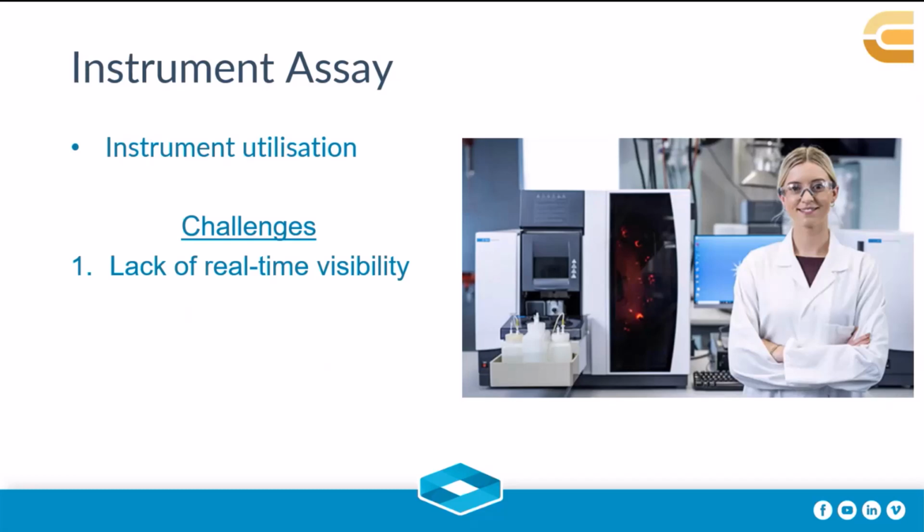So, challenges wise, obviously similar to sample preparation, laboratory managers don't have real-time visibility into the status of samples on instruments, which can affect decision making for improving instrument utilization.